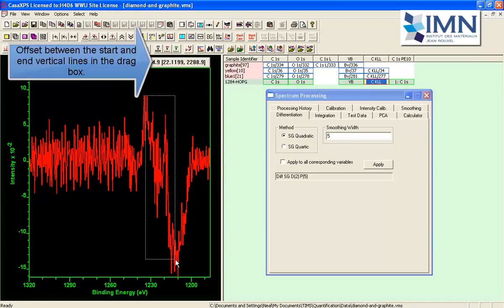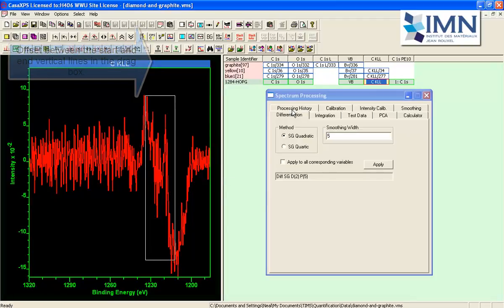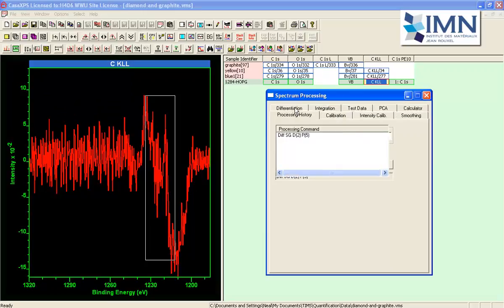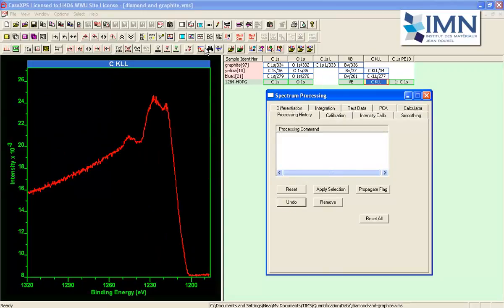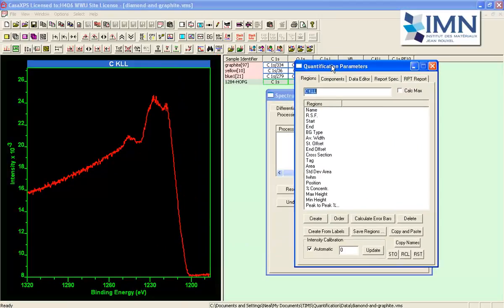So we are looking at 22 for this graphite sample but we can do better than using the differentiation using Savitzky-Golay if rather than using a polynomial of degree 2 to approximate the data when we try and work out the derivative.